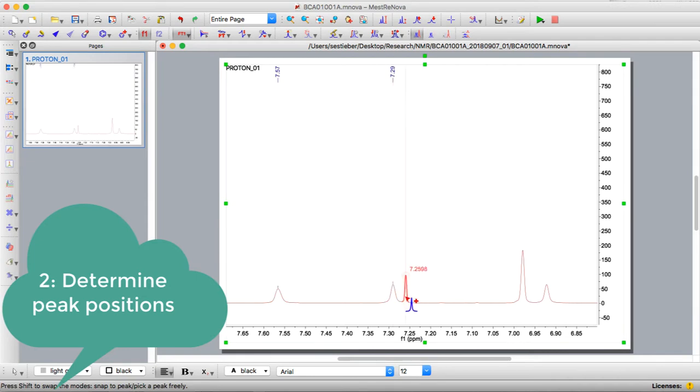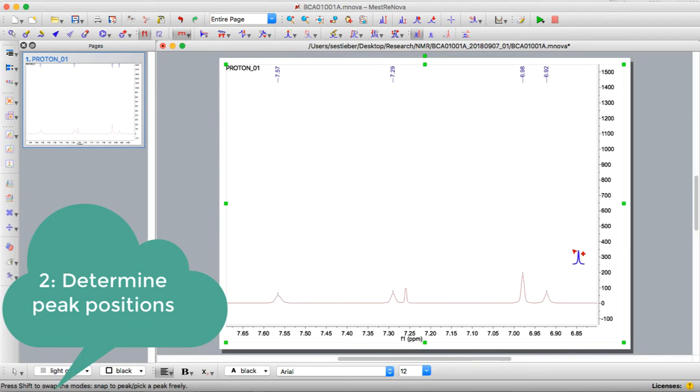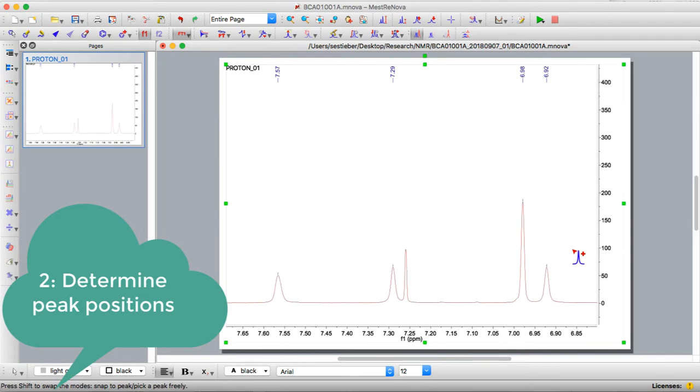We don't want to click on the solvent peak because we know it's solvent. We'll click on all the others, and you can see it now added all the peaks. There is a way to do it automatically, but I don't recommend it because MNOVA often picks too many peaks, and it just confuses your processing.